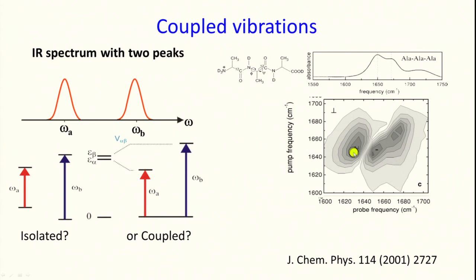As you go from out to in, you can get a hill or you can get a trough if the sign of the absorbance is negative. In this course at this stage, we are familiar with negative absorbance. What we are really talking about is delta A. As we know, for ground state bleach and for stimulated emission, you actually get negative delta A signals. So, depending on that, usually it is color coded to show whether it is plus or minus, and then you get contour lines like this to represent the 3 dimensional surfaces.